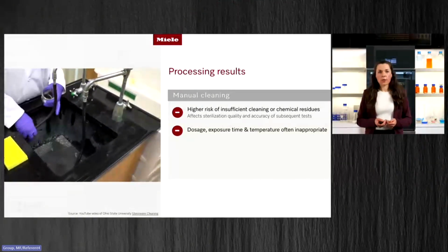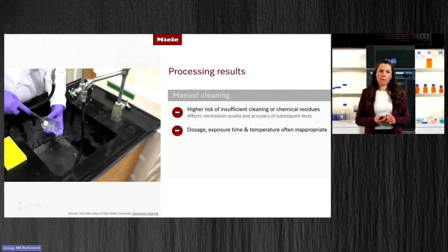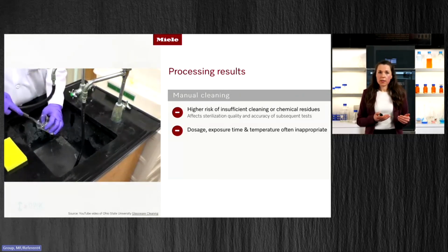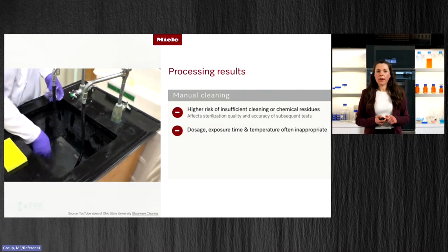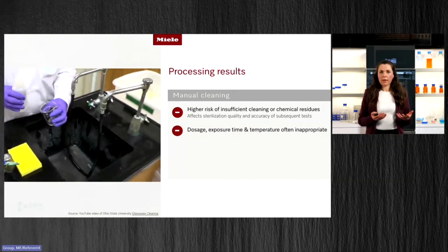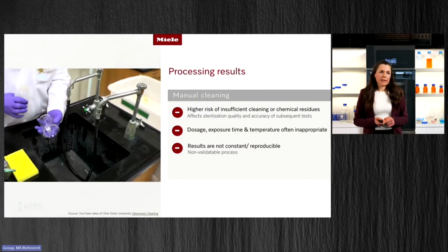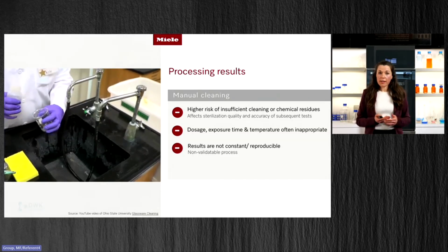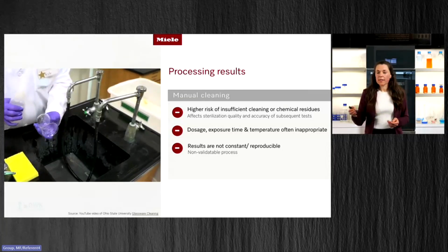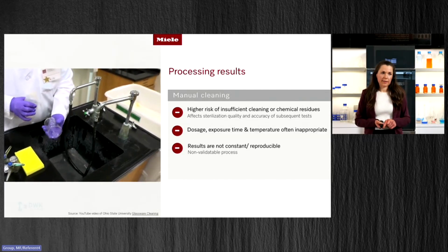Does the cleaning agent reach the entire surface of the glassware? What about the water temperature, or how often do you rinse? These are all parameters. If they are inconsistent, it can have an effect on the cleaning result, and if there's remaining contamination on the glassware, even small residues have an effect on later steps like sterilization or even the subsequent tests, which can be very costly.